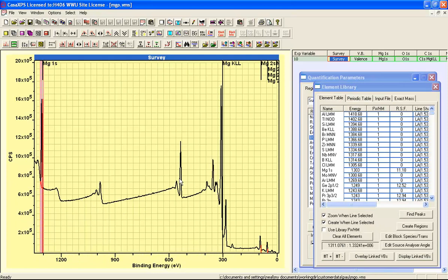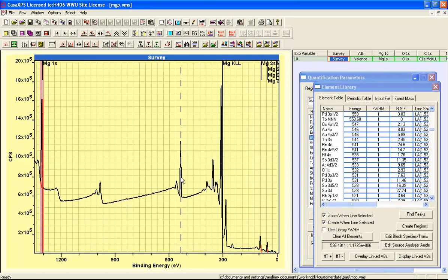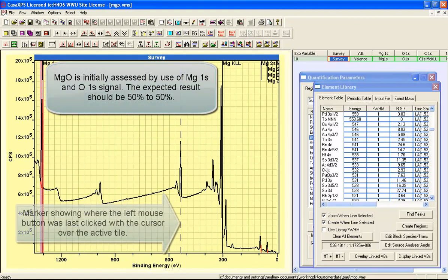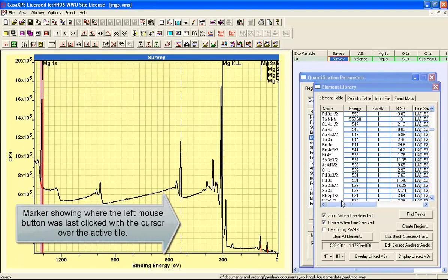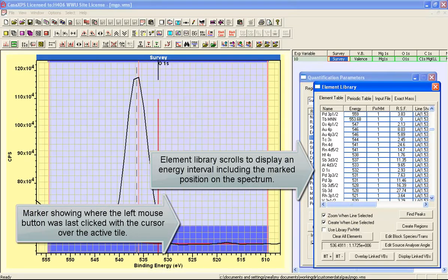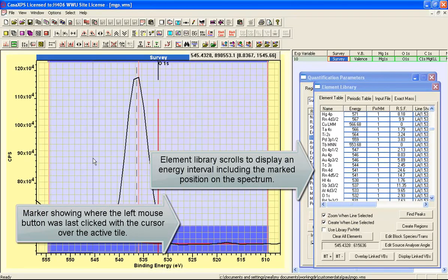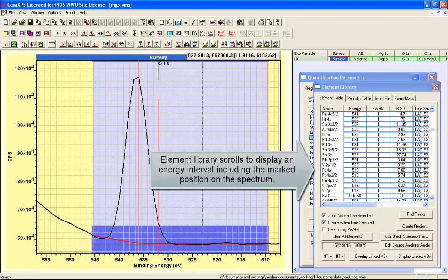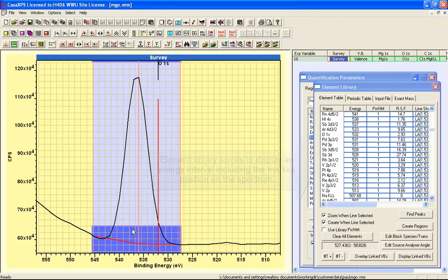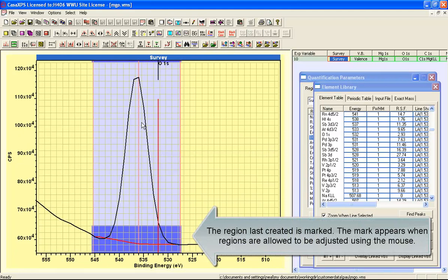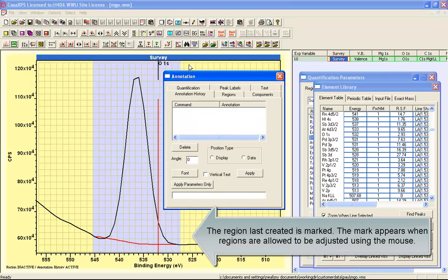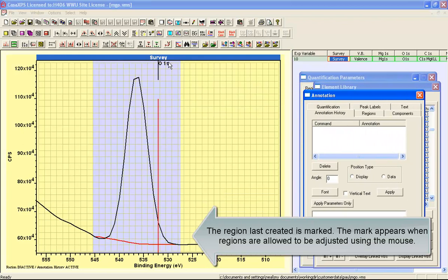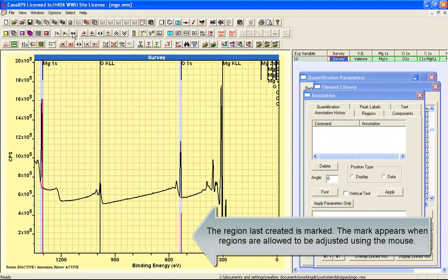So we will repeat this for the oxygen 1s, clicking on the spectrum. This will scroll the element library, and by selecting the oxygen 1s with create line selected, the relative sensitivity factor and an interval representing a region where the signal above background for the oxygen 1s is calculated. And then we have a pair of peaks that should be enough to characterize the magnesium oxide.